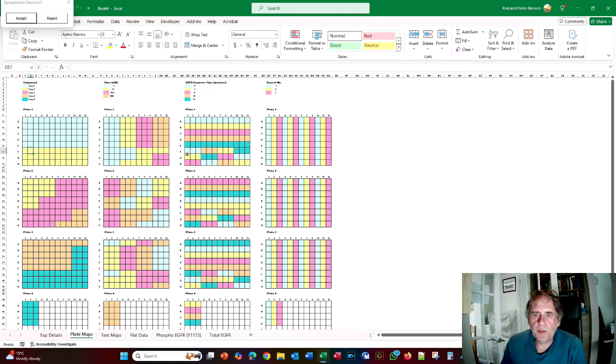Now, you'll also note that the compound is tested at 4 doses, and we have exactly 4 little squares here. So if we knock out the 0 and the 30, then compound 2 will fit nicely completely into this plate, because you'll have 1, 5, 10 will fit in that space for 1, then you'll have 1, 5, 10 for 10 in that space, 1, 5, 10 for 100 in that space, and 1, 5, 10 for 1,000 in that space. So it'll all fit nicely. Then you'll get to compound 3. Now compound 3 has this full space here, so that's all right.